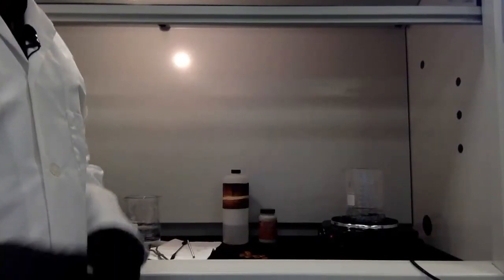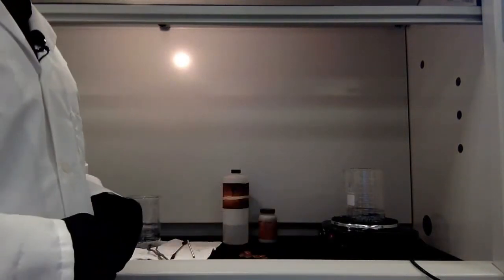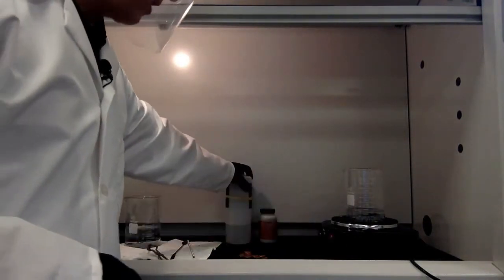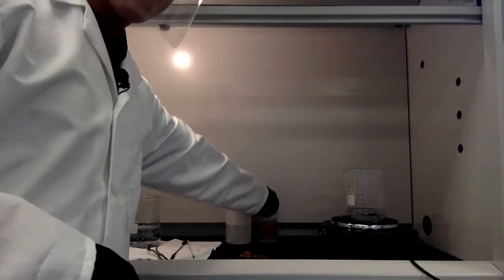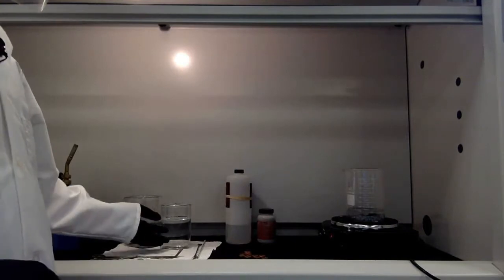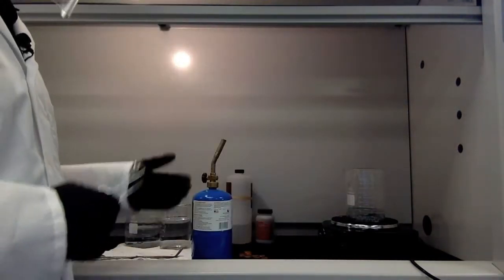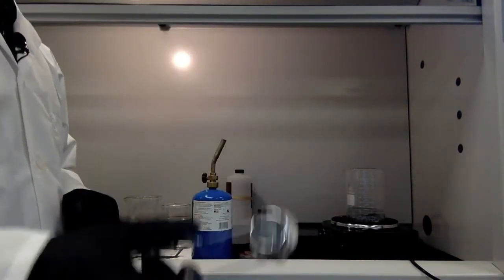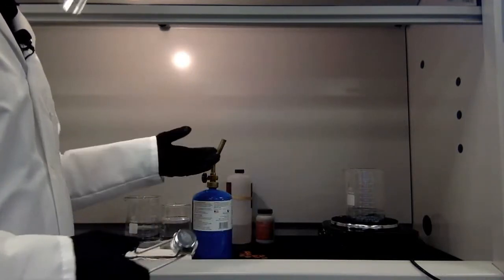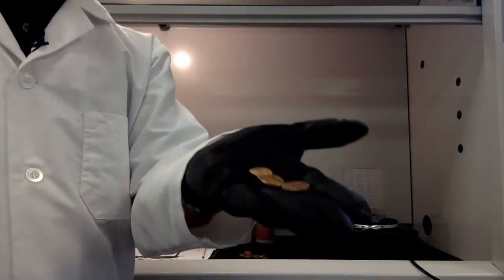Some tools that are involved in our activity today. We have a hot plate because we're going to need to heat our solution slightly. In this container we have sodium hydroxide, and this is zinc powder. I have some tongs to use for transferring items, some beakers of water for the purposes of rinsing, a lab scoop so that I can scoop some of this zinc metal into my beaker, a torch that I'll use to heat the penny when it's time, and this device produces sparks to ignite the torch when it's necessary. But the most important item in this lab? My pennies, of course. The shinier, the better.